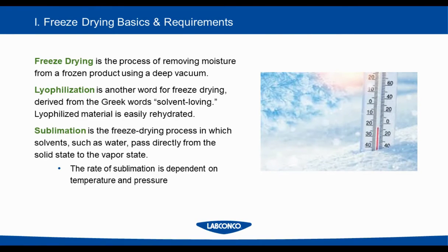We're going to start by discussing some common terms you hear when talking about freeze drying. Freeze drying is the process of removing moisture from the frozen product using a vacuum. Another common term is lyophilization, which is just another word for freeze drying. The term is derived from the Greek word meaning solvent loving because these samples are easily rehydrated. This allows for easy resuspension of samples, making it a great process for sample preparation.